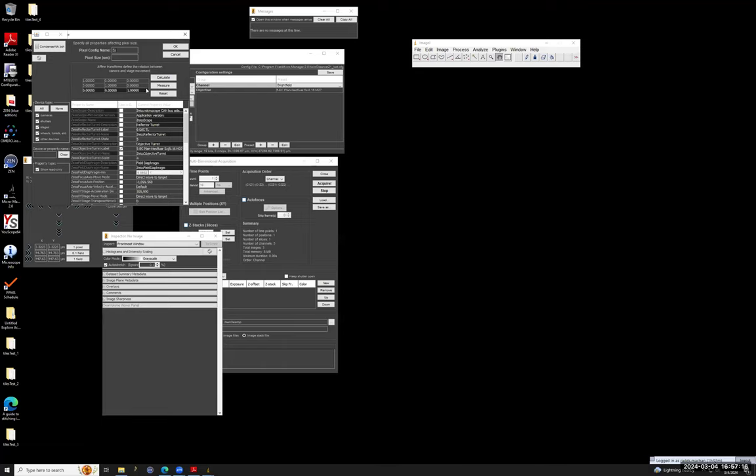And this is not just pixel calibration, but it also encodes how the camera image is rotated. So if I'm setting up a new system, I have to play around a bit here so that the camera rotation is correct with respect to the movement of the stage. I might have to invert this matrix if I find that it's not working correctly, so that when the stage moves, I do the tiles so that the images correctly connect to each other.